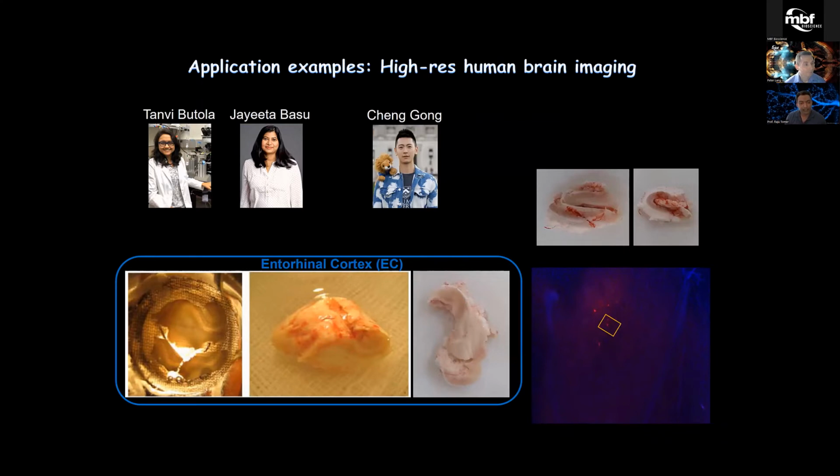They are very interested in understanding various mechanisms of brain diseases, especially focusing on epilepsy and Alzheimer's. As part of their experimentation, typically they get these chunks of human brain from neurosurgeons, from diseased patients, and they do electrophysiological recording from a few of these neurons, trying to figure out what is wrong in the system. At the end of that, they are able to fill those neurons with a certain dye to label them, which then can be visualized.